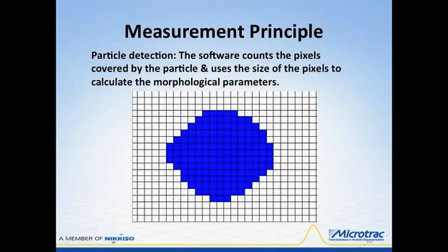An enlarged digital image is shown here, large enough to see the pixelation. Just knowing the size of the pixels, all the size and shape parameters can be easily calculated. And no a priori knowledge of the materials is needed, like refractive index, density, or viscosity, as they are in other size analysis technologies.